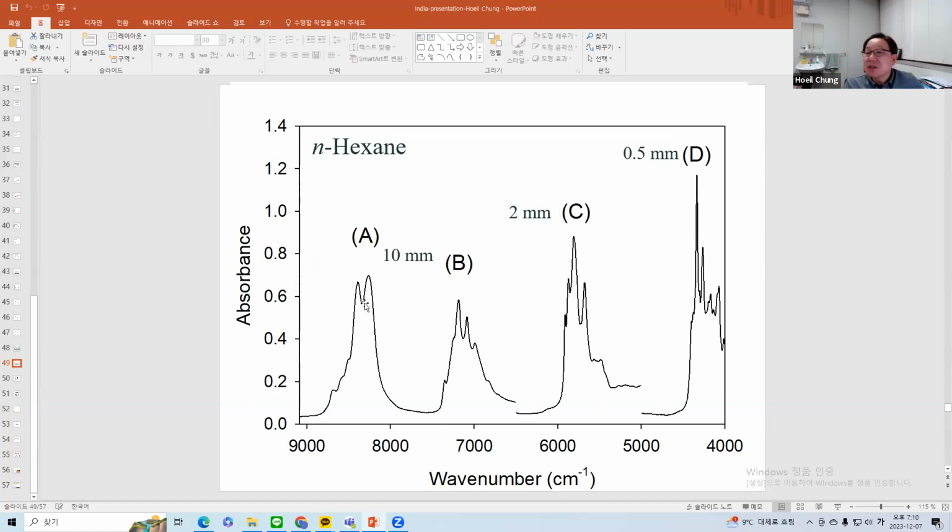Maybe you can use this range, it is okay with a 10 millimeter thickness. But if you want to have a more selective and more sensitive measurement, I think you might have to go to this range. But as I mentioned before, if you want to use this range, a fiber optic based spectrometer cannot be used, because the fiber optic itself absorbs the NIR radiation in this range. In that case, you have to rely only on this range. So it depends on your application. You have to consider proper ranges to maximize the accuracy of your measurement.